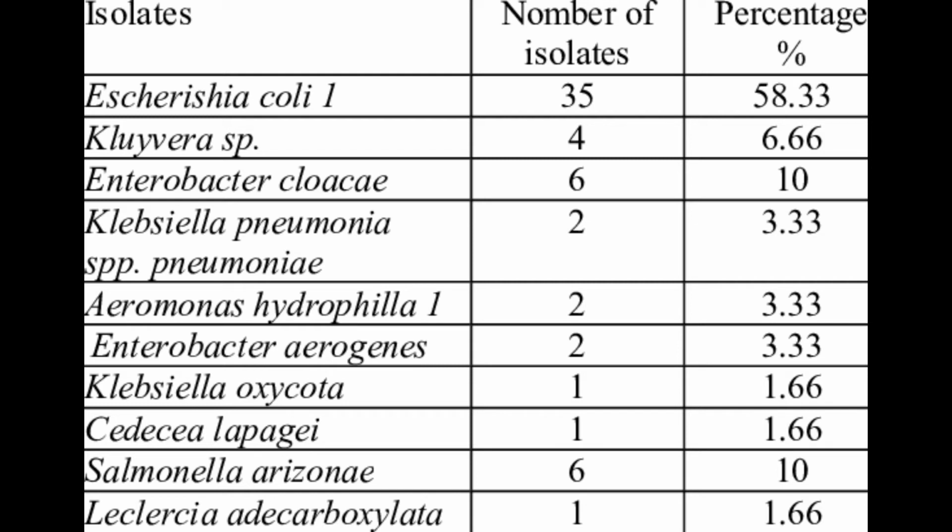Now let's talk about the nitrate reduction test, in which nitratase or nitrate reductase reduces nitrate to nitrite. The medium is a nitrate agar slant, and the reagents are 2 drops of sulfanilic acid and 2 drops of alpha-naphthylamine. The positive result is a red azo compound, p-sulfobenzene azo alpha-naphthylamine.